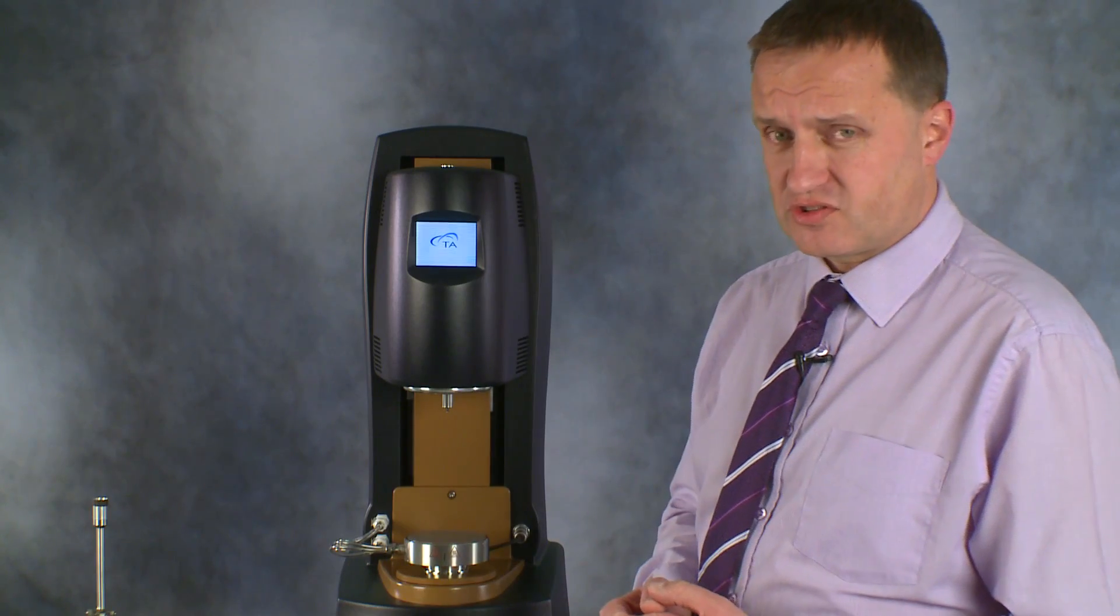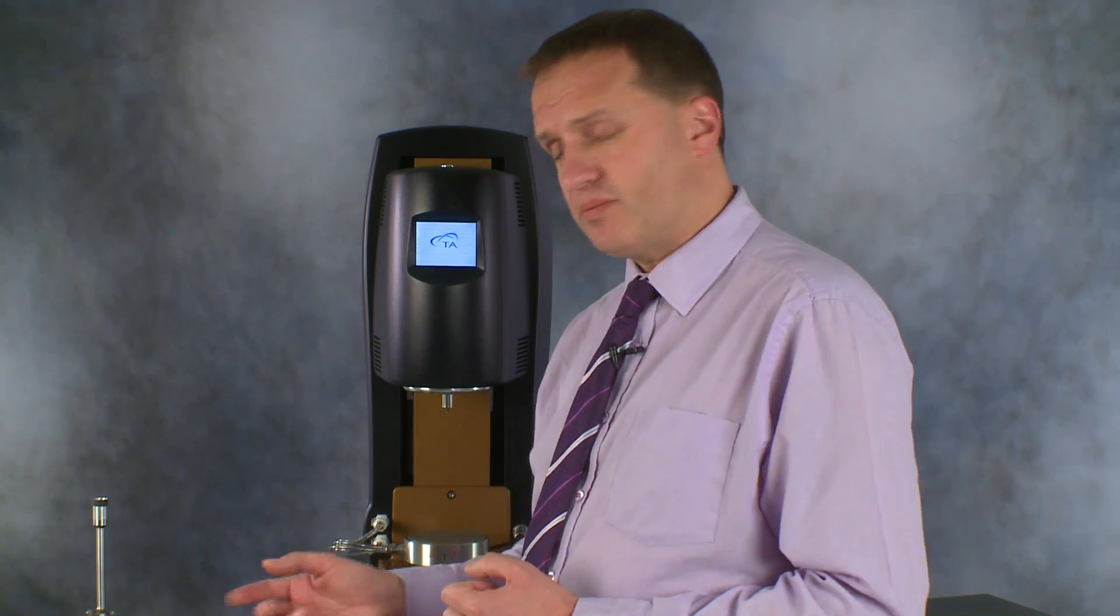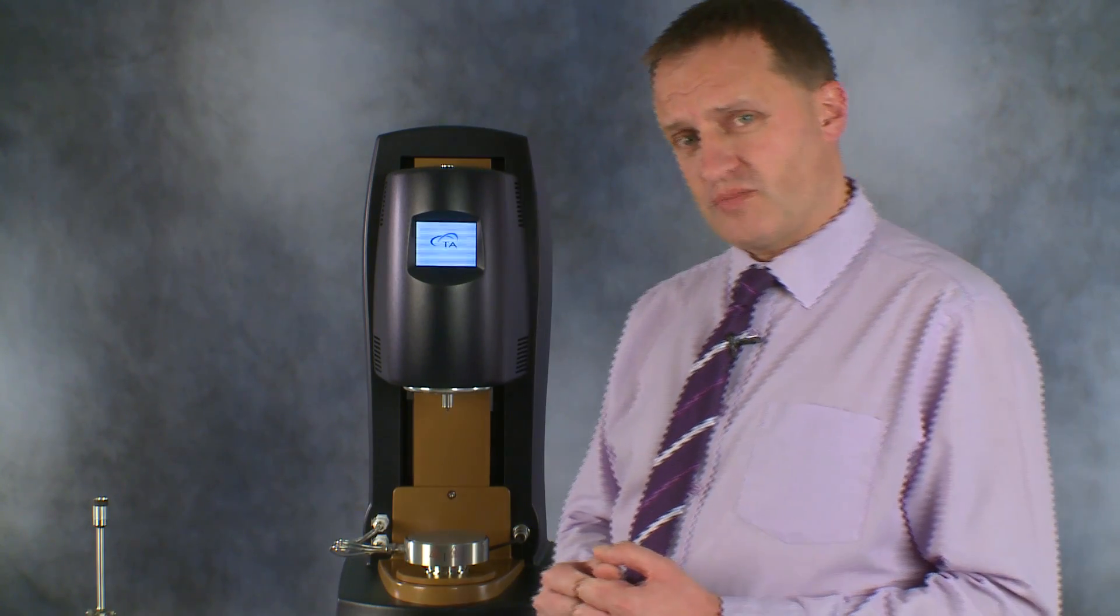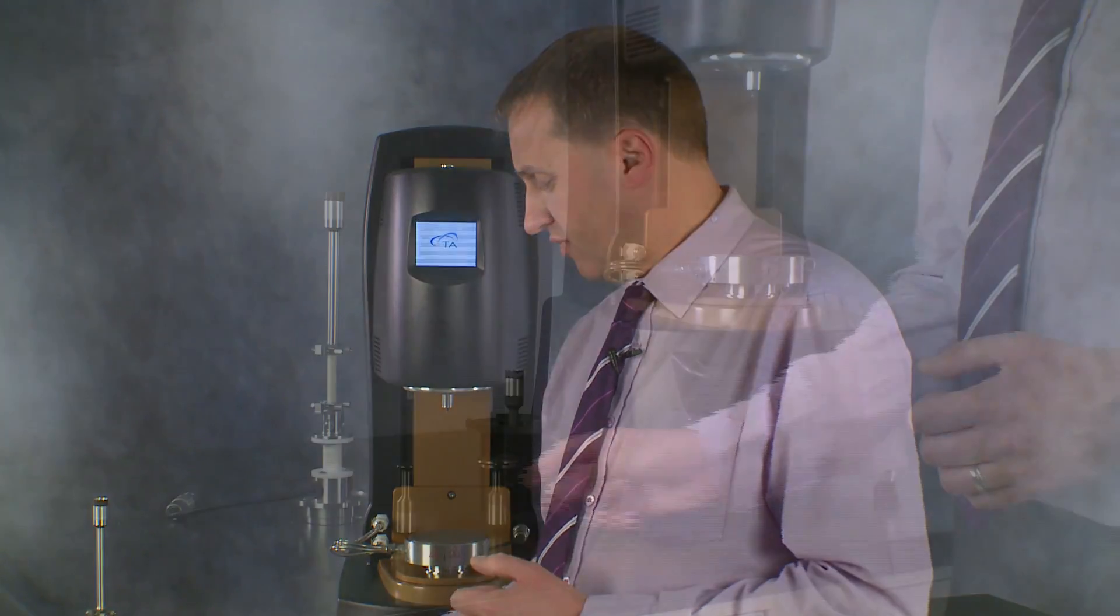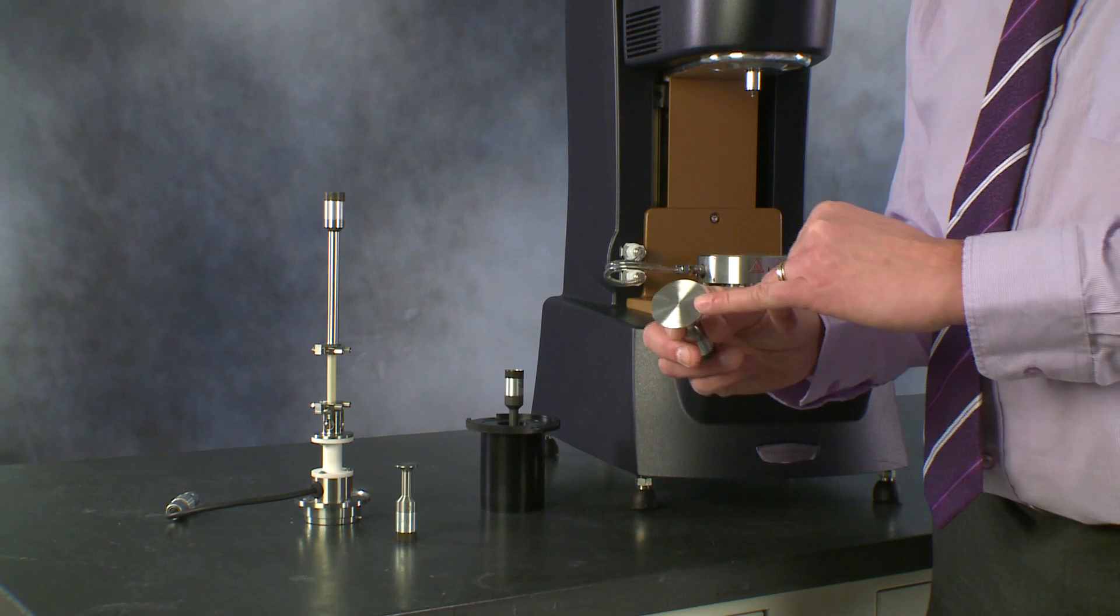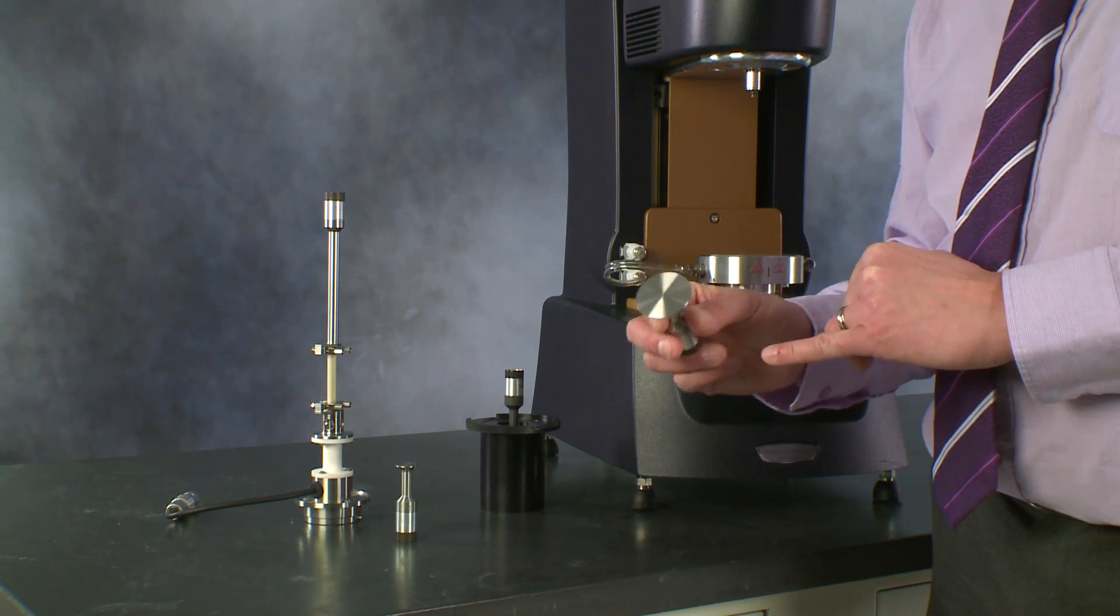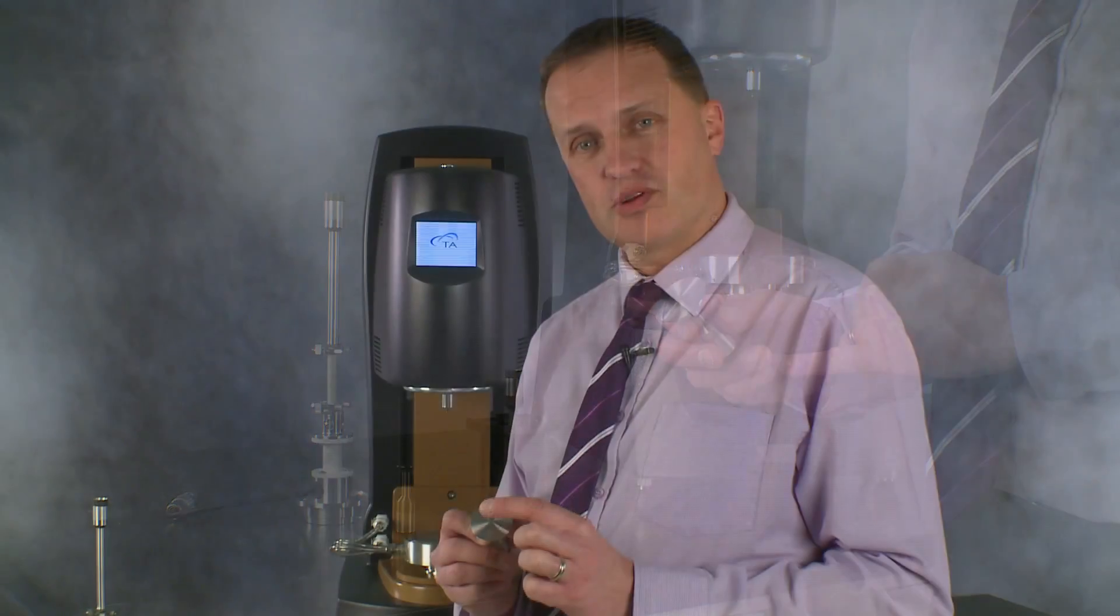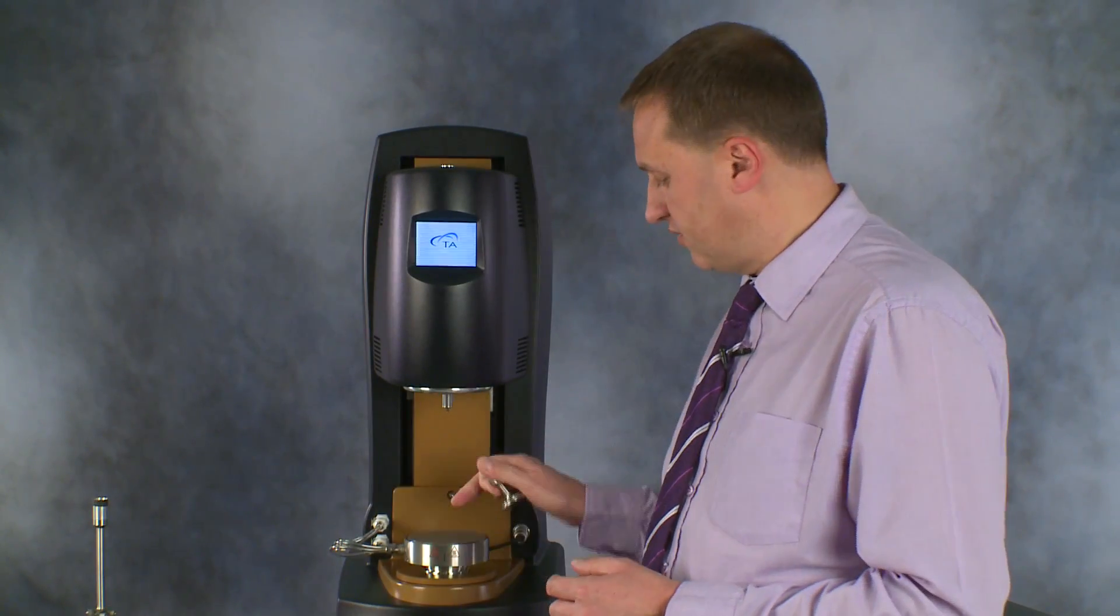There are a range of diameters and choices of materials, as there are for the parallel plates. So we have to think about what cases and what time to use which system. For cones, the drawback is that they're not very good for non-colloidal systems. Any particles can physically jam between the small gap between the cone itself and the lower plate.